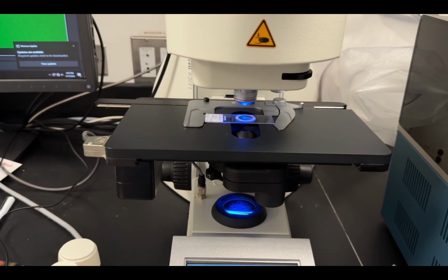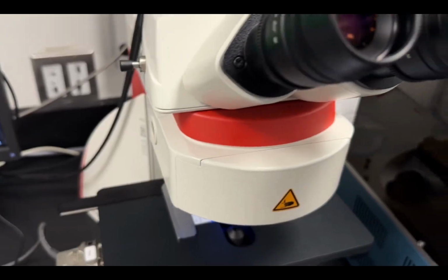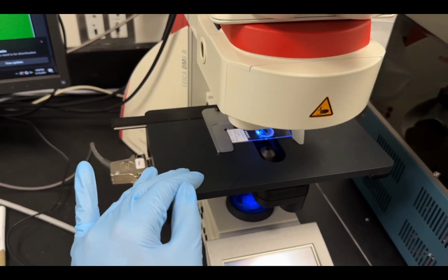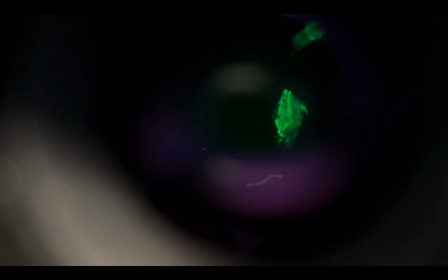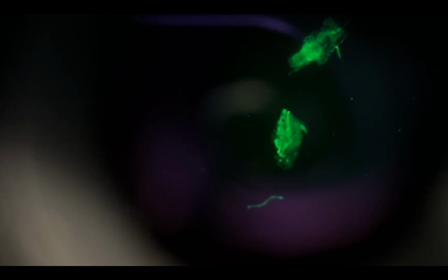So once I have it in the place I want it to be, I'm just going to look under the microscope and then I'll show you guys what I'm seeing. Okay, so this sample looks a little interesting. I was trying out something new where I micro dissected them before I stained them. So a lot of your samples are not going to look like this by any means, but if we look inside the fluorescence microscope, you're going to see we have two heads in there that are fluorescing green.